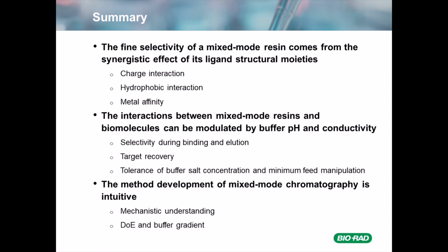The mixed-mode chromatography method development is pretty intuitive because after we understand the interaction mechanism, we can still use design of experiments and buffer gradient to come up with a chromatography method, just like what you have been doing with the traditional chromatography method.